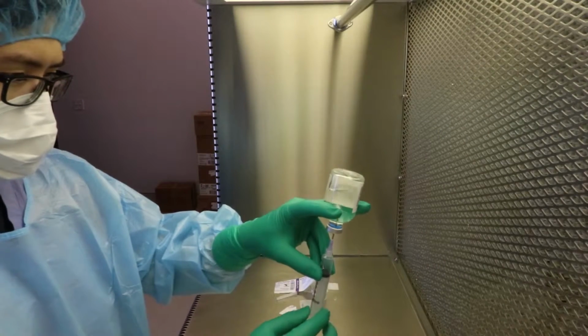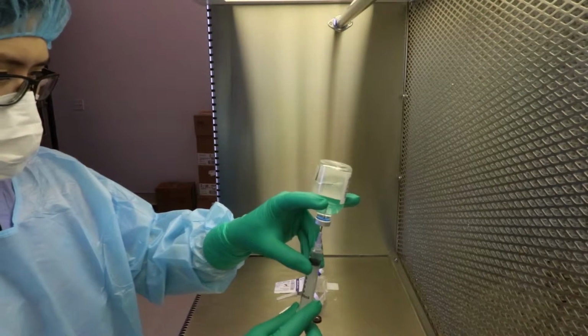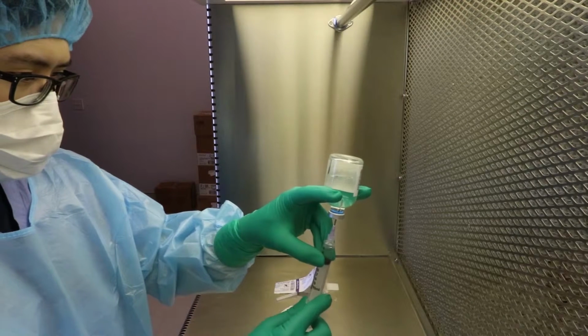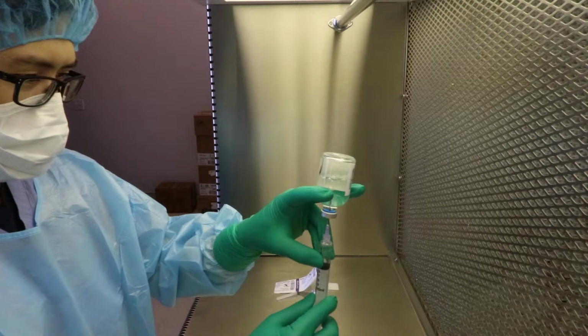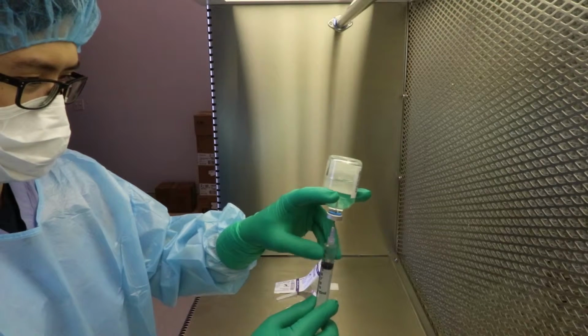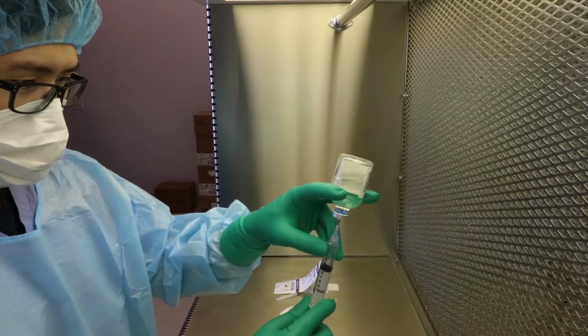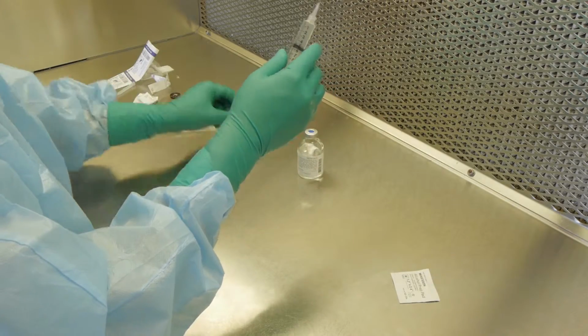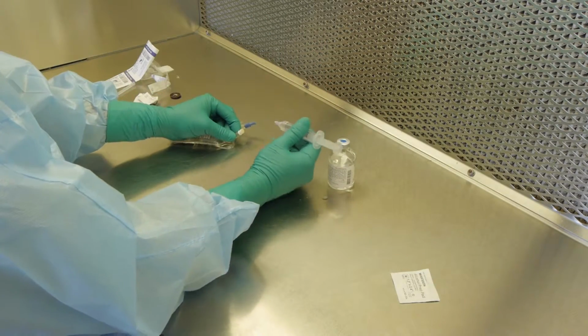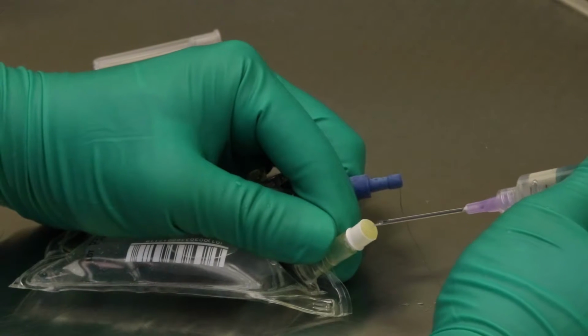Inject part of the air into the vial. This will equalize the pressure inside and out. Don't attempt to push all the air in at once if it's a large amount. Notice when I hold the vial and syringe, my fingers are still spaced apart to avoid blocking the airflow across the needle. Pull back on the plunger and draw 5 mL into the syringe. Lastly, draw up the solution and inject it into the IV bag.